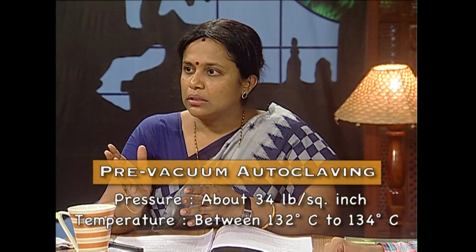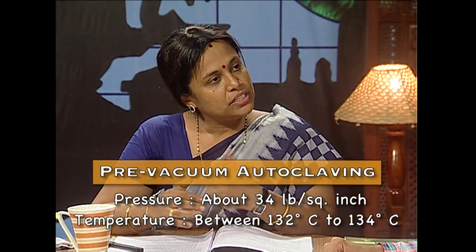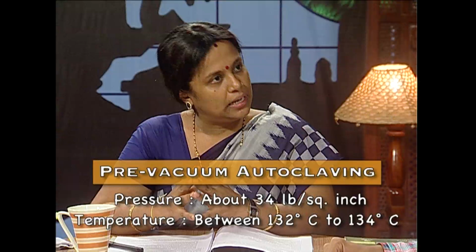Here the pressure is taken up to, I think, 34 pounds per square inch, and the temperature is also raised drastically. So with this tremendous pressure and higher temperature, the duration of autoclaving is reduced from 15 minutes or half an hour to say 4 minutes.